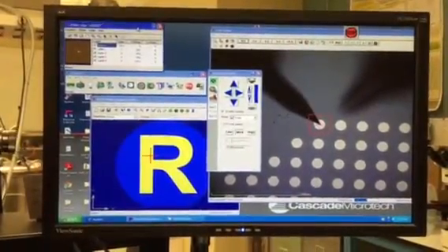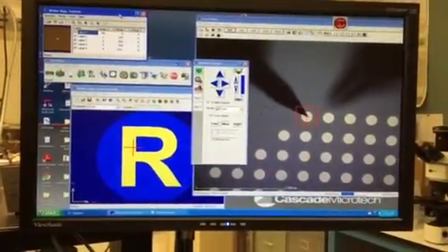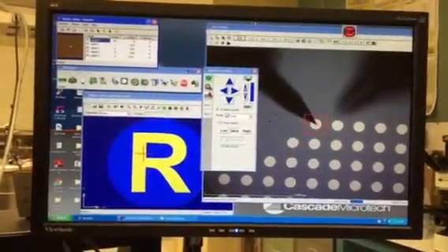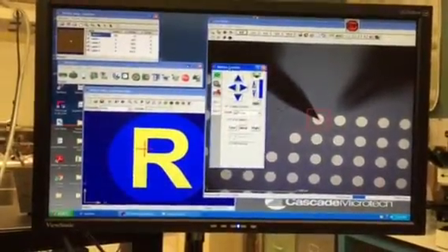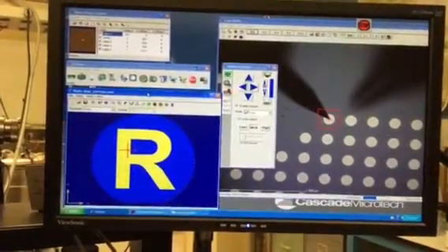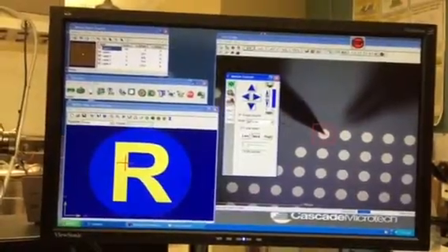What I like to do on mine is I've always run multiple monitors. I run WaveView in one and Nucleus in the other, just because Nucleus has this approach of multiple windows, which can be nice, but it also makes management sometimes a little bit more difficult.